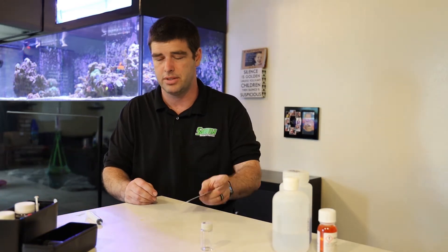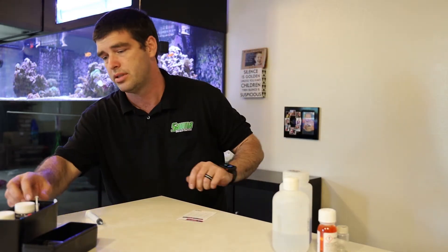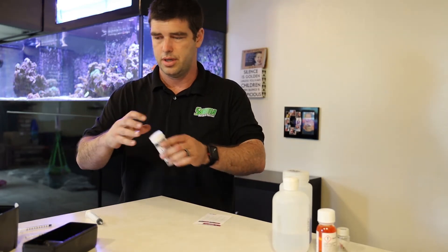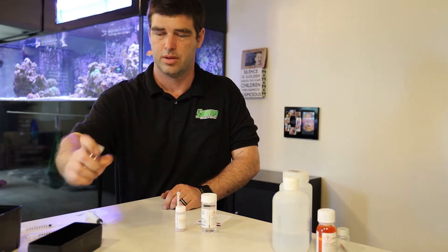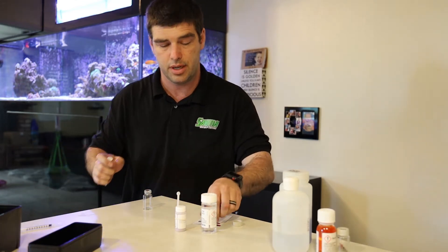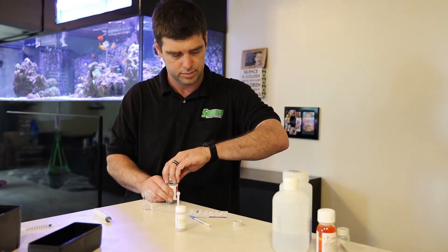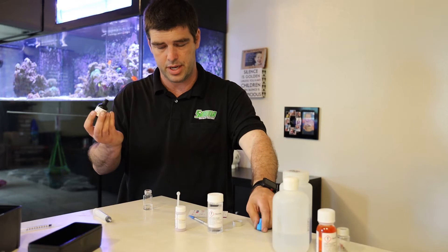Next up we have calcium. I'm going to set aside all of those so they're not in my way. Got my calcium card, my reagent, my vial labeled calcium, and for this one we're only going to need five milliliters of water. Five mils of water. Five drops of reagent A.